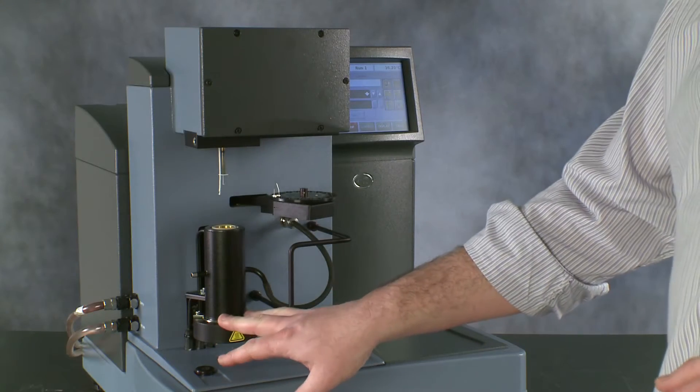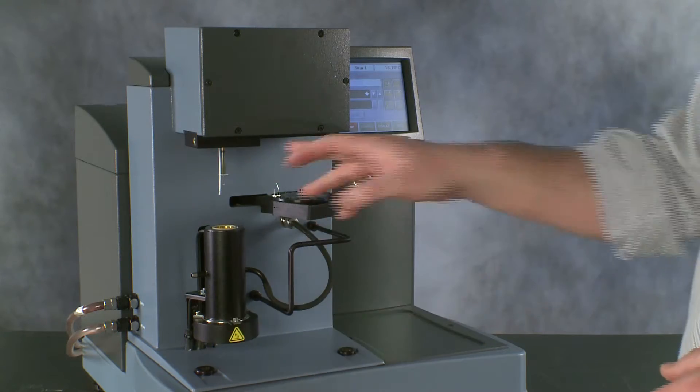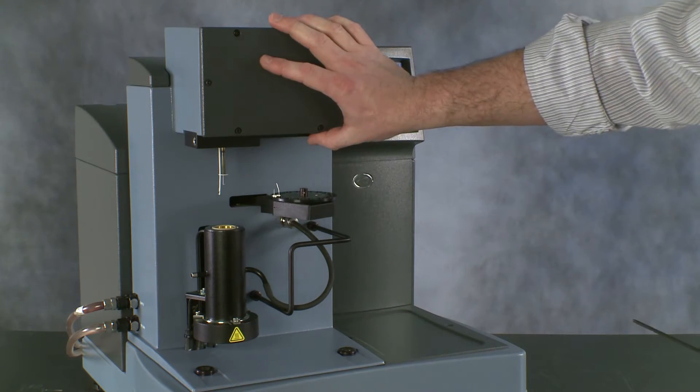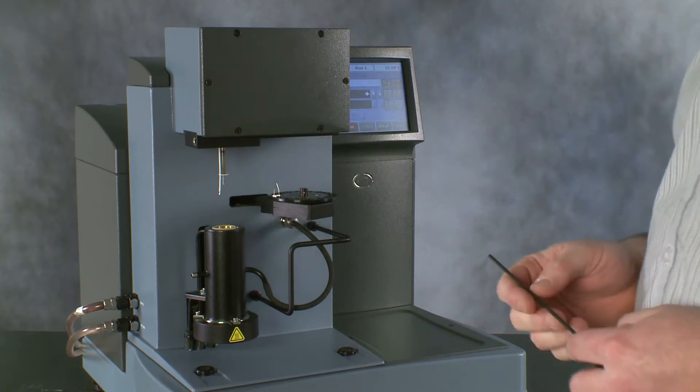To replace the hang down wire, we need to make sure our furnace is in the low position, so we can get access to the base of the hang down wire, and we need to remove the balance housing cover. That's held on by the six screws on the front of the cover.